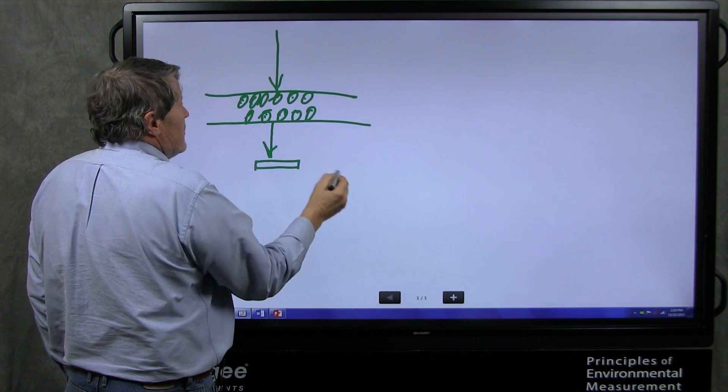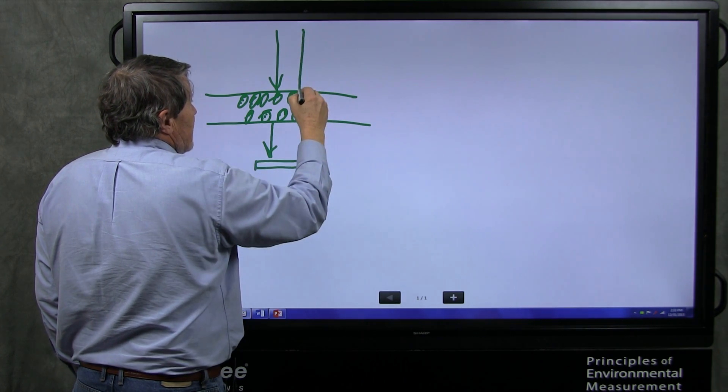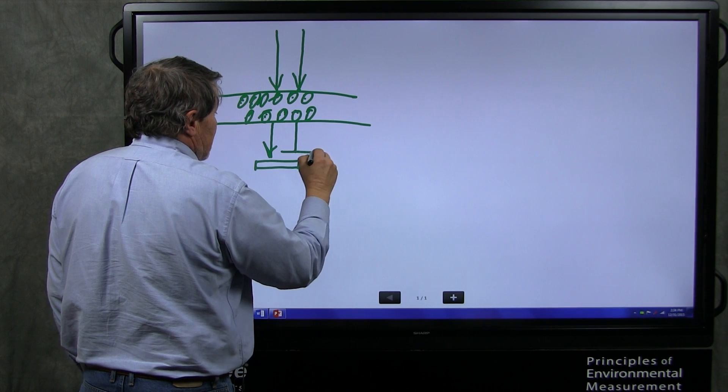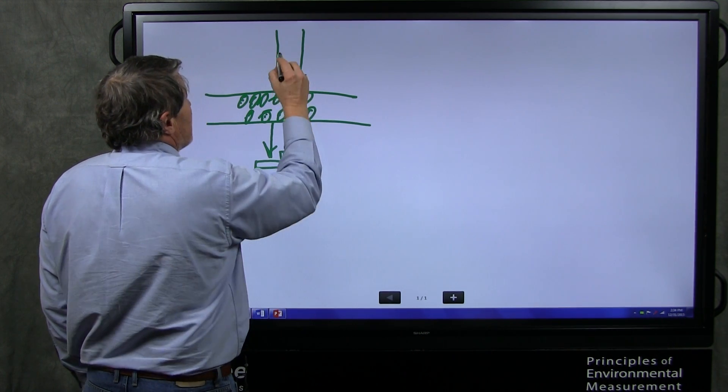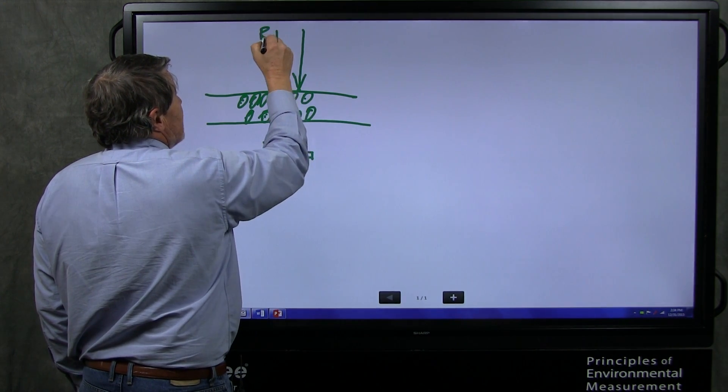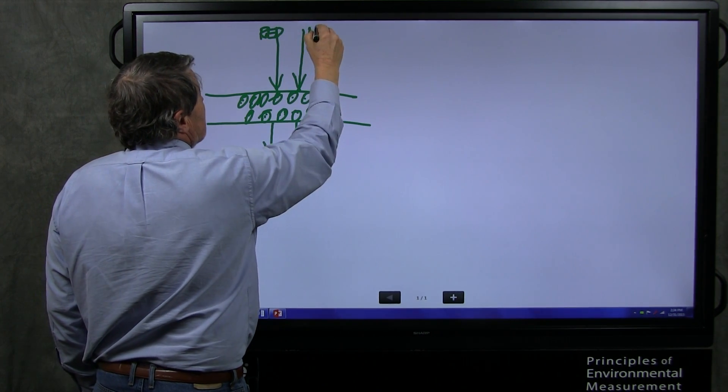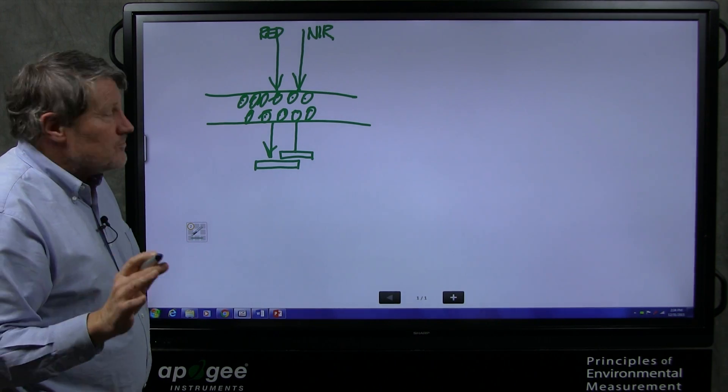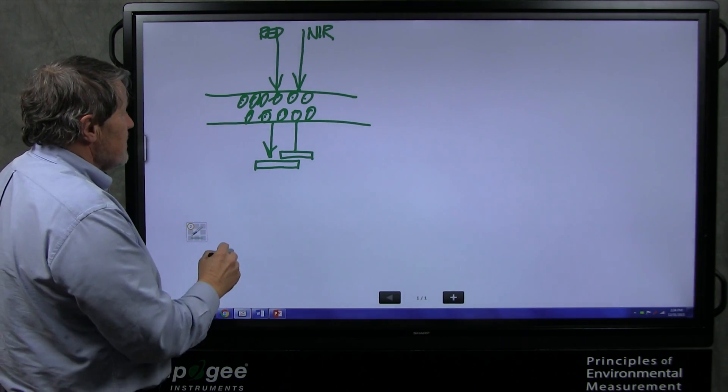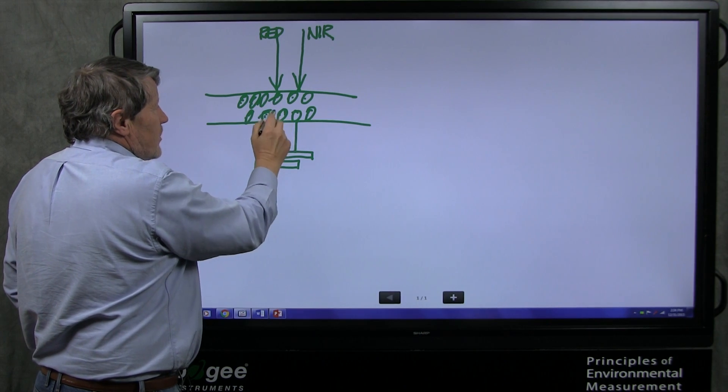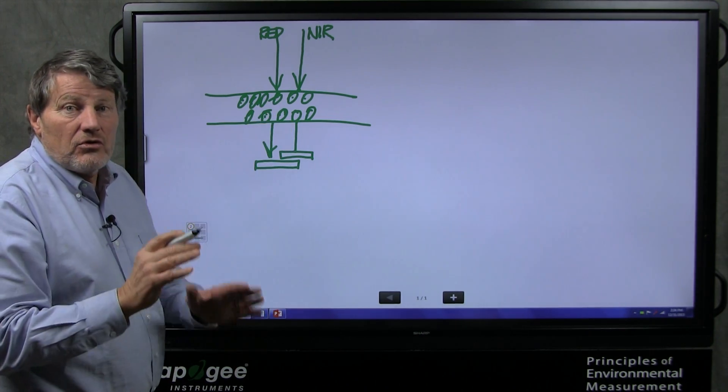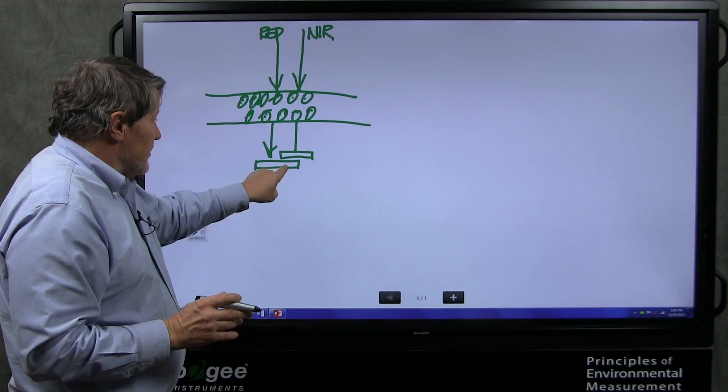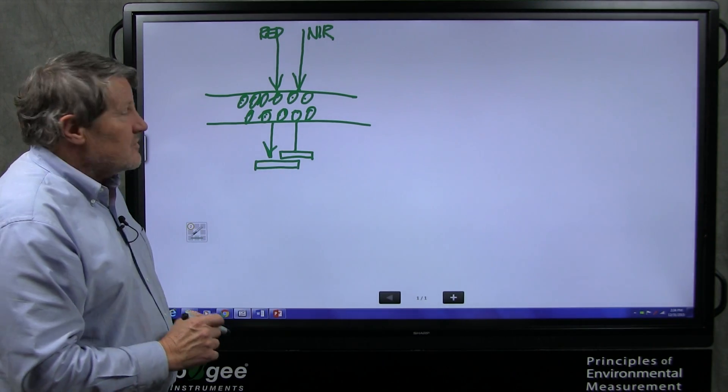So to really be able to measure this, we take another wavelength of light, and another detector down here, and this is red light, and this is near-infrared light, NIR. These are all on the Apogee website, the details of these. And now by subtraction, we can get at the amount of chlorophyll in this leaf. And it's the electrical output of these two detectors.